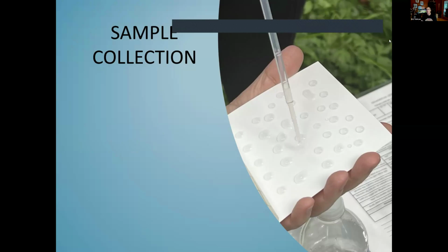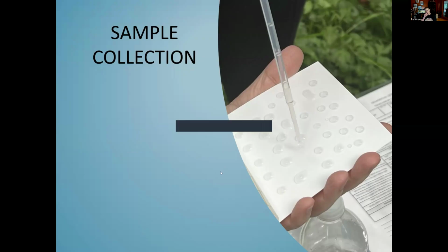And so one thing I didn't mention about sample collection is I showed that we were placing it in one single drop in the middle of the card. One thing that some groups do and some people do to make it so that you get access to all the corners of the card is to use what's called the dots method. So instead of just putting it in one spot, they distribute it in dots throughout the card.